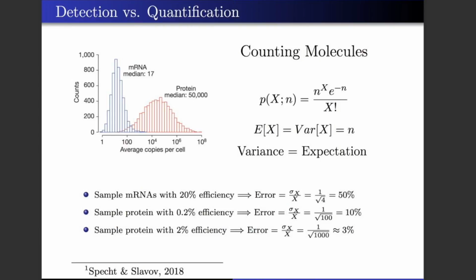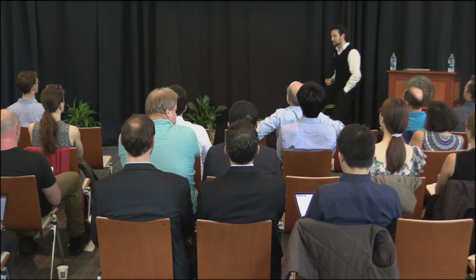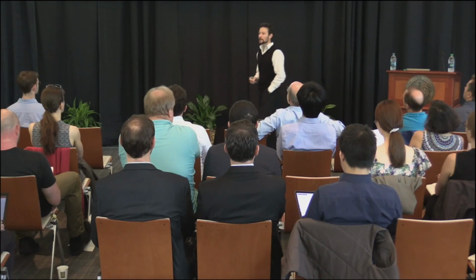So, I already alluded to it, one of the major problems is delivering the proteins to the instrument if you start from a single cell. And that turns out to be a very difficult thing.